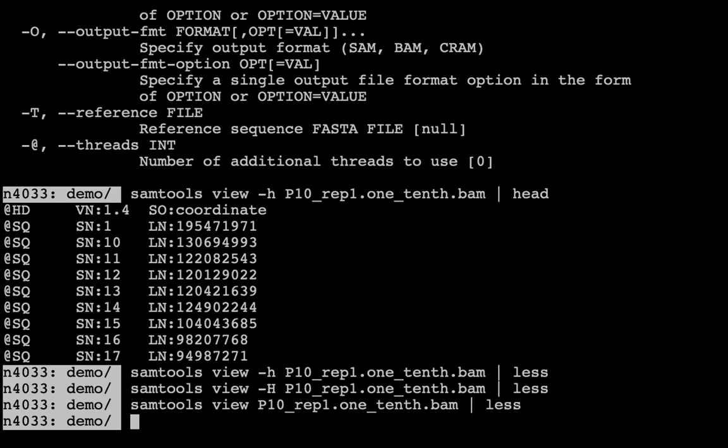So this one is on your laptop. This one is actually running this shell here. It's running on the cluster somewhere. This one's running here. And this is where you want to do this.